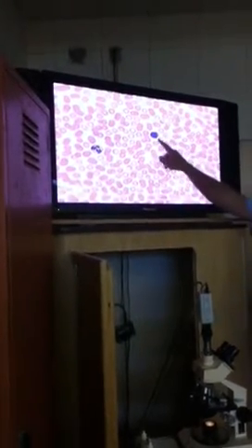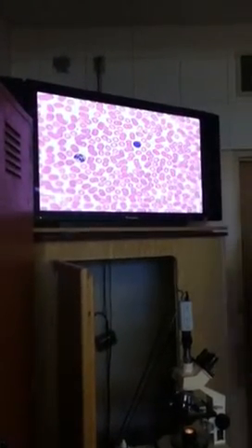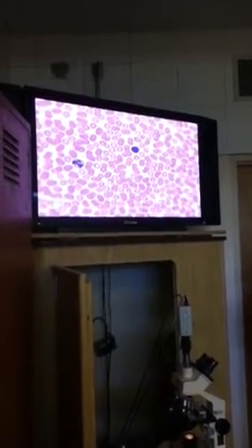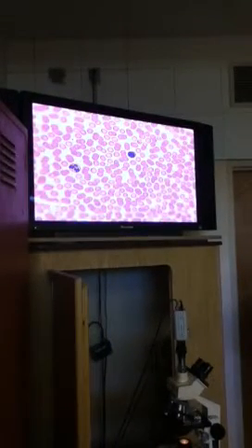And those are the most plentiful out of the leukocytes. About 70% of all the leukocytes are going to be neutrophils. If you look over here, you're going to see that almost everything's totally encased, except where you have a halo. Lymphocyte? And those are going to be your lymphocytes. So whenever you see a totally encased leukocyte, but then there's a slight ridge around it, we call it a halo, that's going to be a lymphocyte, either a T cell or B cell.